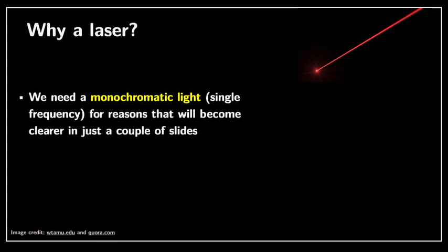I will say also that measurements can be made with different laser light. Typically people use red, green, and blue light, but you can use different frequencies, and those are usually very finely tuned.